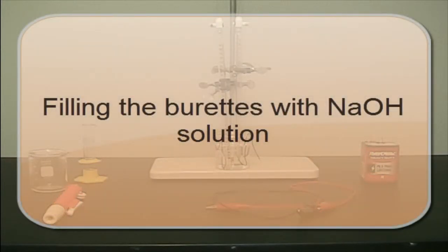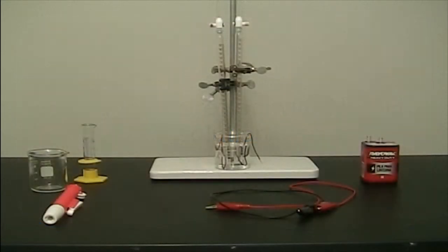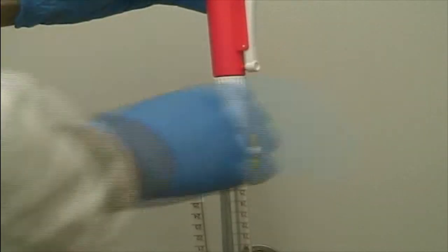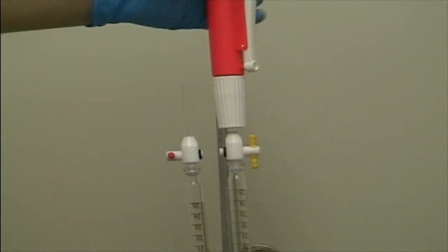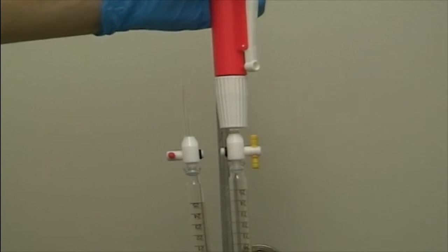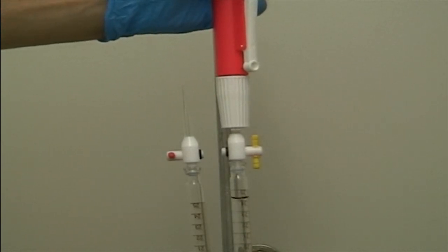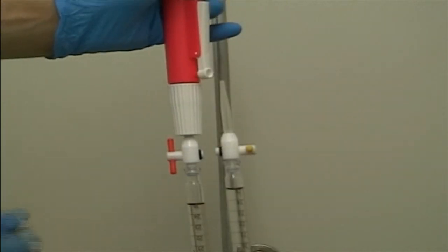We found that the experiment worked best if the burettes were filled with distilled water that was already charged with sodium hydroxide. Thus, with the burette's open ends now being immersed in the sodium hydroxide solution, each burette valve was independently opened and affixed to a pipette pump filler dispenser. This pipette pump dispenser was then used to draw sodium hydroxide solution up and into each burette, filling it to the 25 milliliter line.